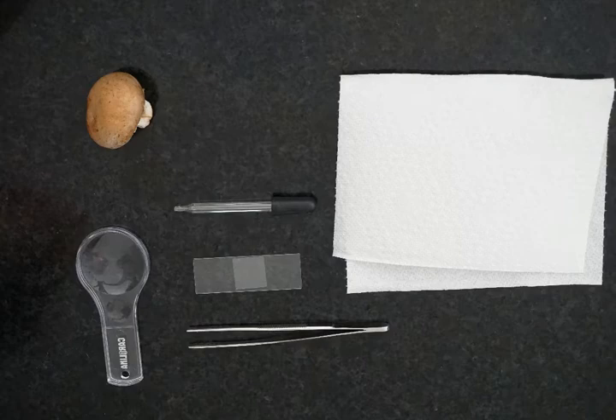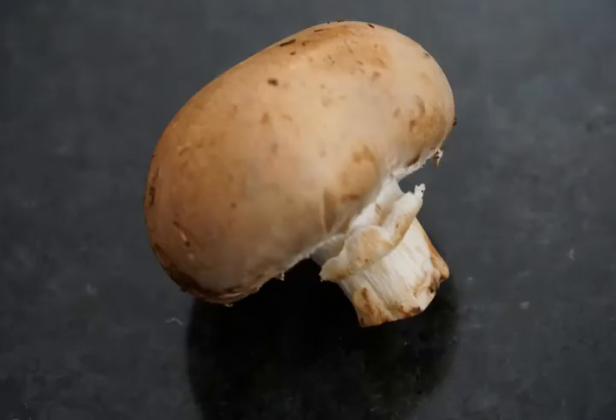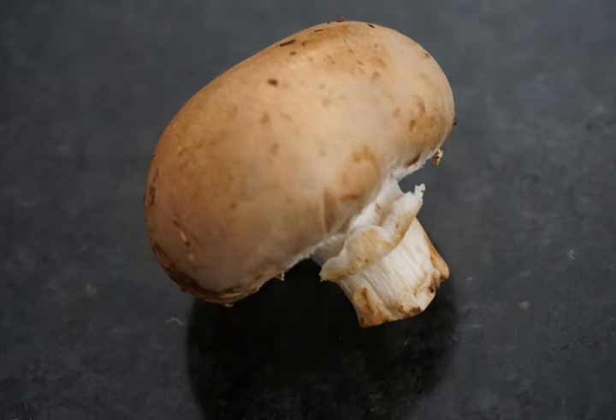You'll also need a microscope, which I don't have pictured. The first thing you're going to do is draw a picture of your mushroom and label the stalk, the cap, and the gills.